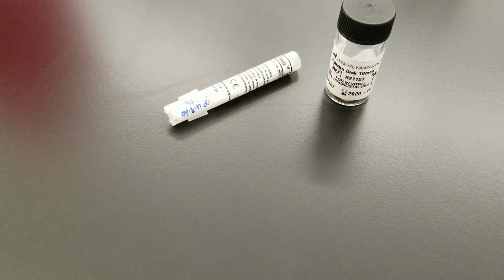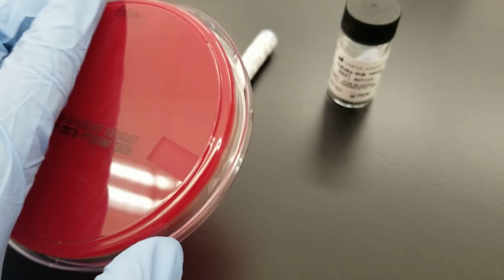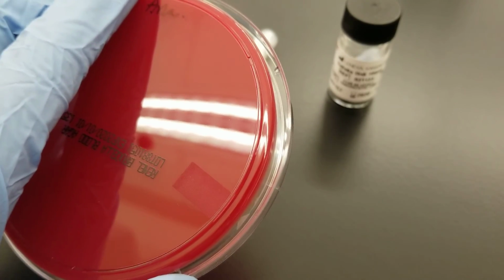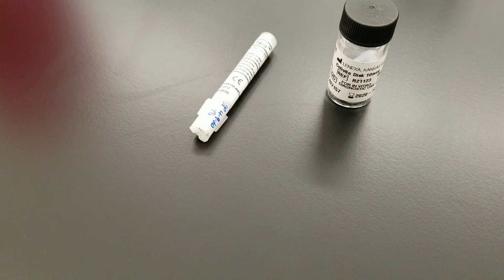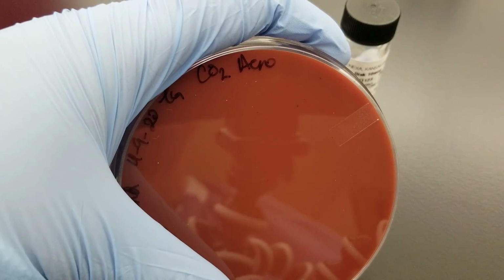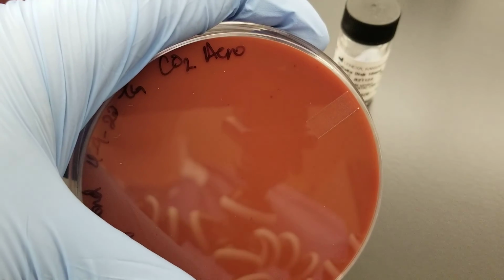Okay, so let's go ahead and get started. When you do this, you're going to have 2 chocolate plates, okay? And you'll have a Brucella blood agar plate, so that you can put this one in the anaerobic environment with a purity chocolate plate, and then you'll put the chocolate plate for the aerotolerance portion of it into the CO2 incubator. So you can see I've labeled one for CO2 and the other one is for anaerobe.